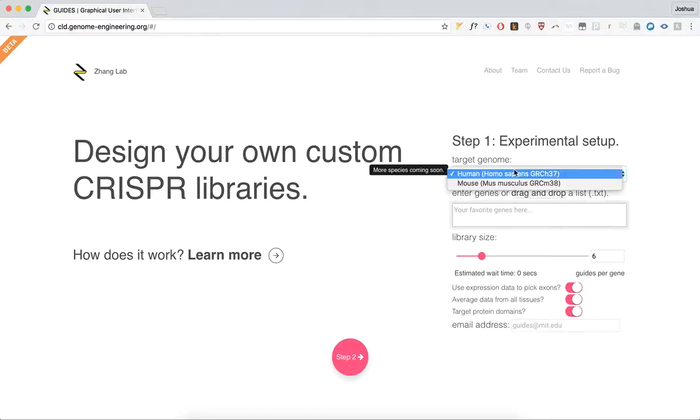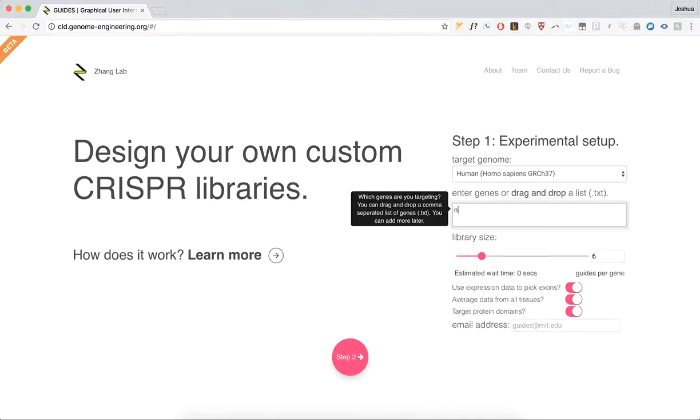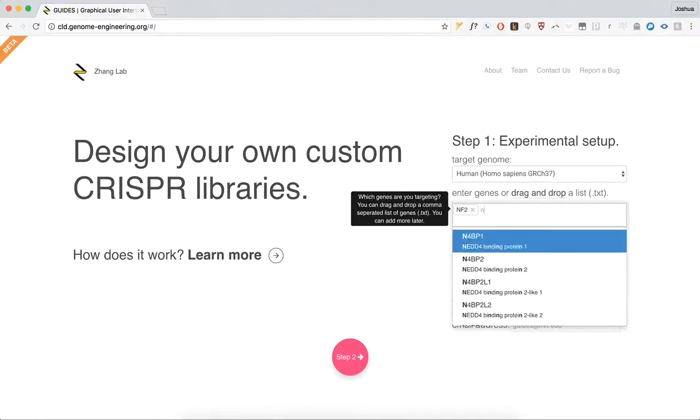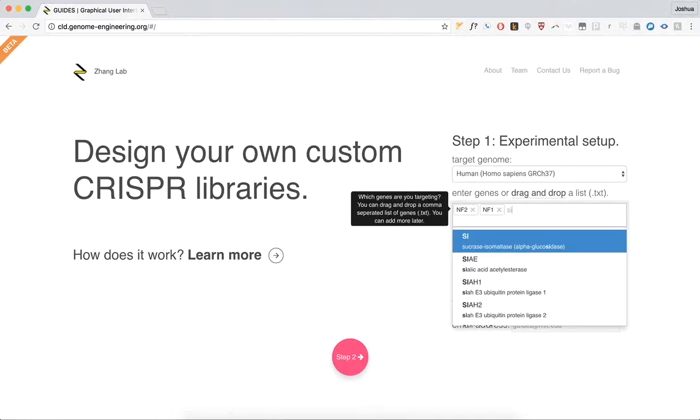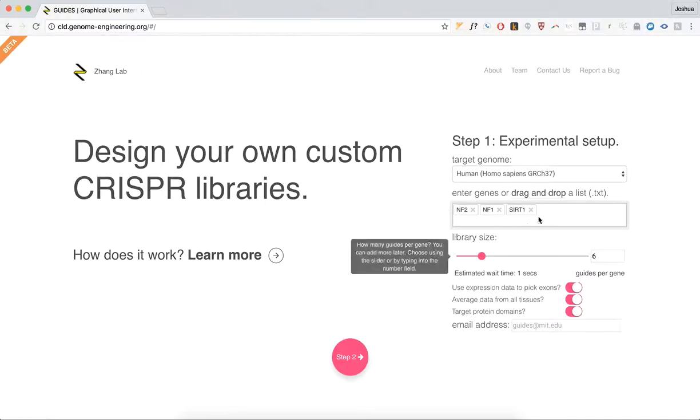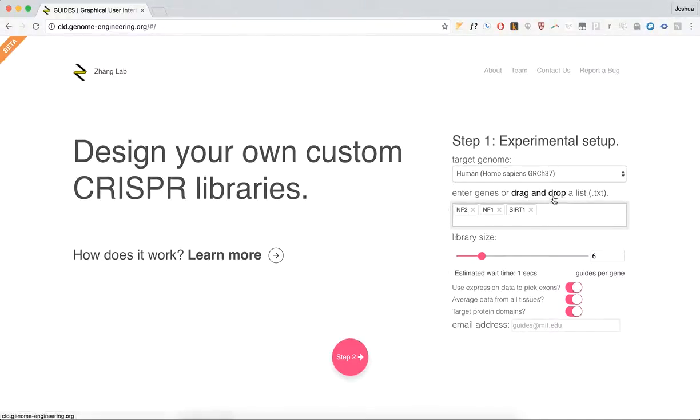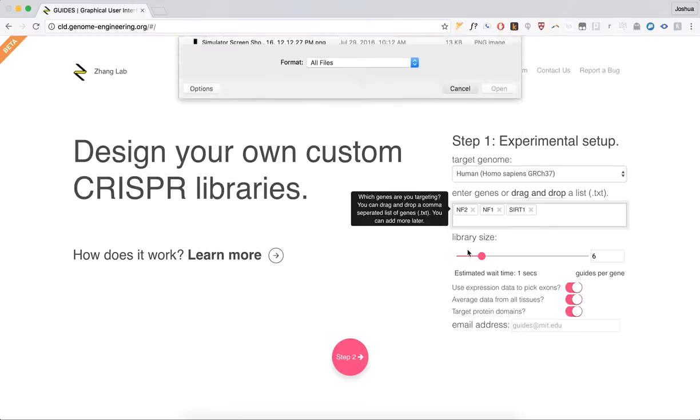First, choose your target genome. Then, enter the genes that you'd like to target in your experiment. You can also drag and drop a list, or you can click here to do that automatically.